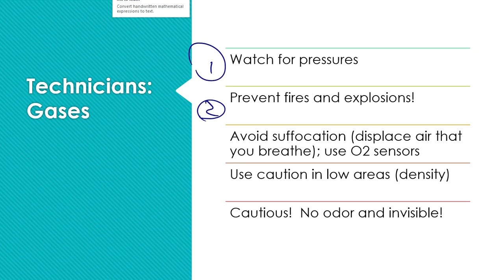So it's your job to help prevent these fires and explosions from happening. So if they do happen around gas tanks, folks, we got problems. We got issues because these things can turn into little bitty bombs if we're not careful.